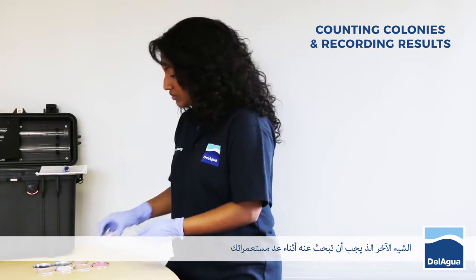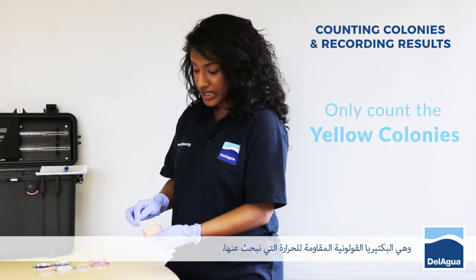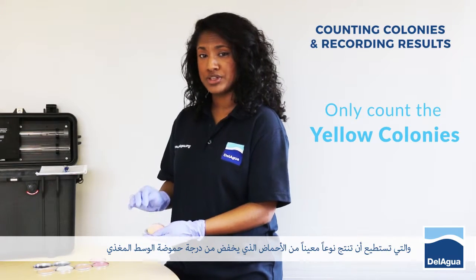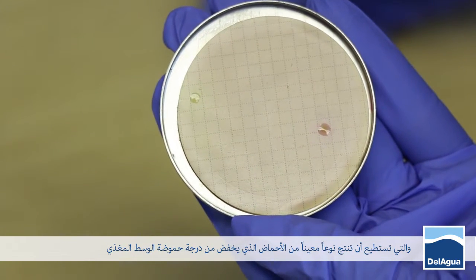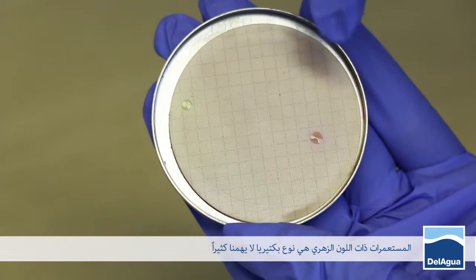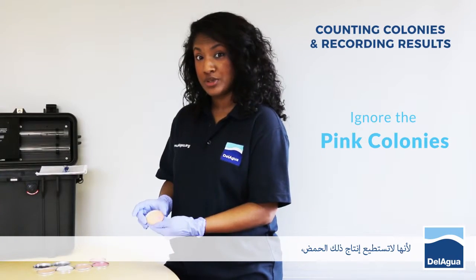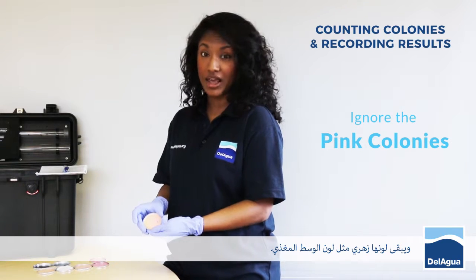The other thing to look for when counting your colonies are the yellow colonies only. These are the thermotolerant coliforms that we're looking for, which are able to produce a particular type of acid which lowers the pH of the media, rendering the colony yellow. The pink colonies are the types of bacteria that we're not really interested in and these aren't able to produce that acid and they remain the same colour as the media, pink in colour.